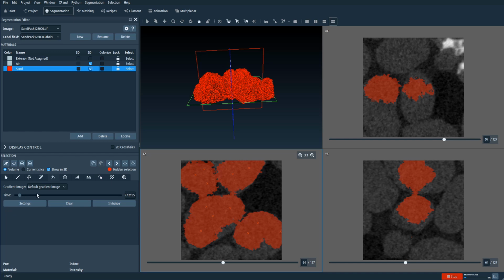All right. So just in summary, to give you a better intuition here, the values here control how fast the region is growing through time, and in general also control how much the region growing respects the edges and changes in intensity values.